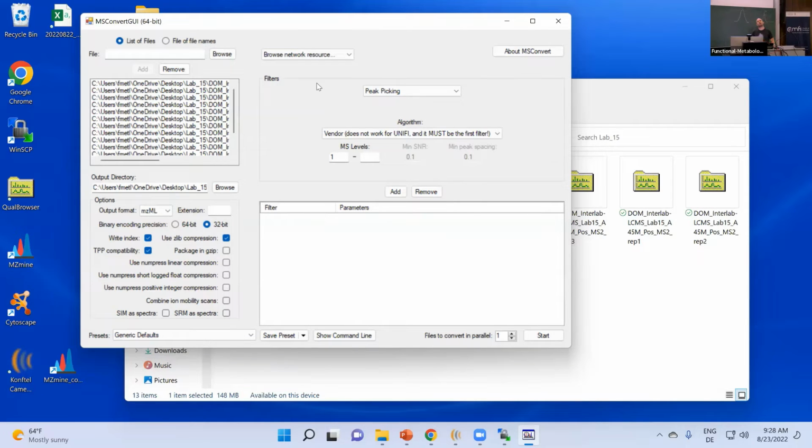At least in an MZML file, if you download some files, you can actually check that. You just open the MZML file in a text editor, and they had local maximum as the algorithm. They had peak picking or something like that in the processing steps, and then local maximum. Which is, and you checked the vendor, but yeah.